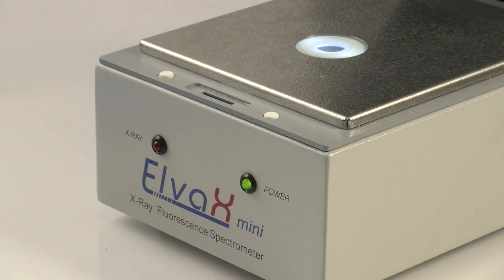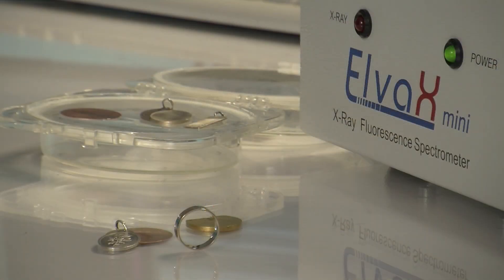Elva X-Mini is capable of analyzing all kinds of material types, including solids, liquids, and powders, with no or minimum sample preparation.